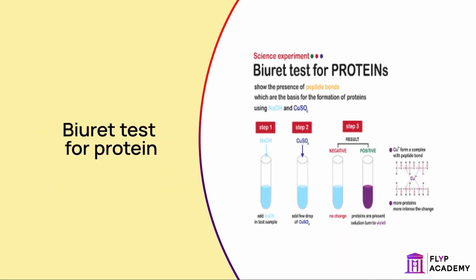We can test for the presence of protein using biuret reagent. This is a blue solution that turns lilac when protein is present. This is a positive result. A negative result is when the biuret reagent remains blue. Meat, egg white and protein powder would give a positive result for the biuret test for protein.